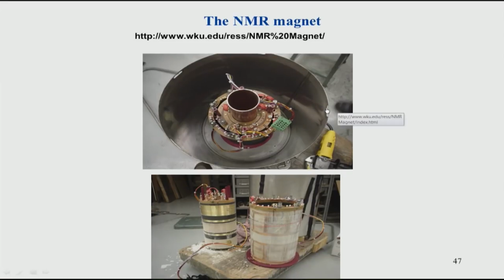And then around this particular container, you fill one more container which has a vacuum, so that this liquid helium which is inside does not evaporate, because we want the liquid helium to stay there and not evaporate very rapidly. Therefore we surround it by a vacuum, and then also we surround it by liquid nitrogen, which is another layer of dewar around this. The liquid nitrogen helps in reducing the evaporation rate of liquid helium, and then again you have a vacuum and so on. So, you have different concentric layers to prevent the liquid helium inside the innermost container from evaporating, but of course one cannot avoid evaporation.